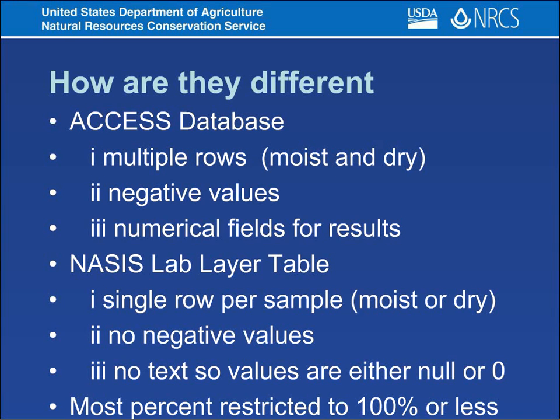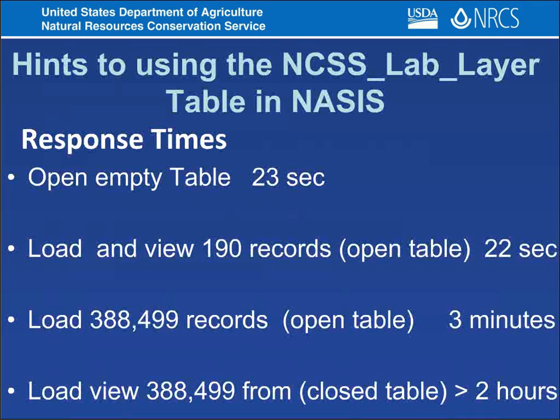So part of this is due to the history of the database, and that is that the repository or the results database was often used by researchers, and we had this website front end on it that actually had some logic to it that would convert negative values to either nulls or zeros.